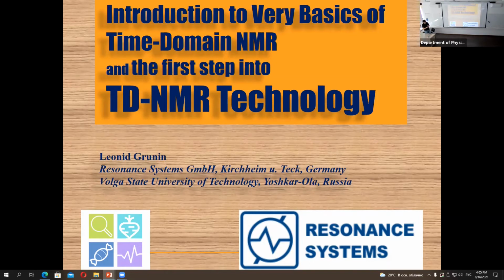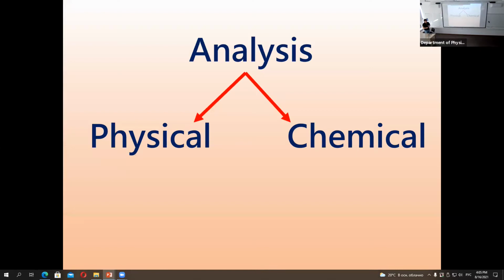We will talk today about magnetic resonance and time domain magnetic resonance, what the difference is, and what instrumentation can be utilized. Anyhow, all these methods are analytical methods, and we mostly work for chemistry, for chemical applications, to do analysis, to understand what the structure is, what the dynamics of our samples are.